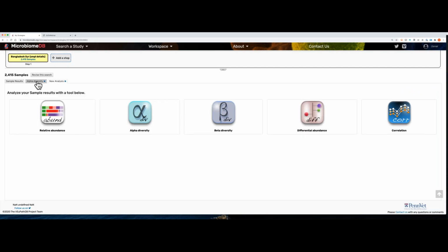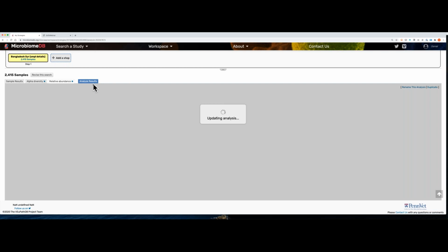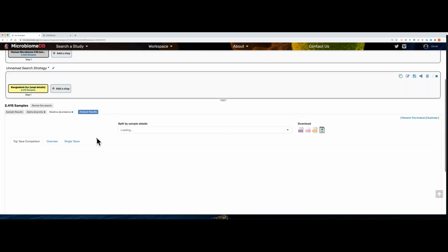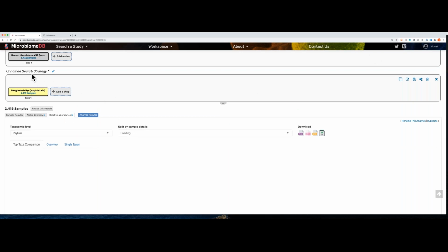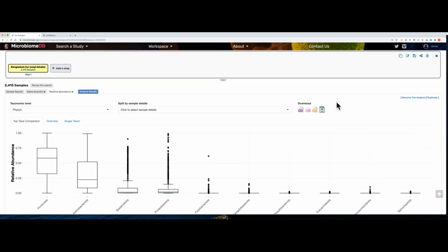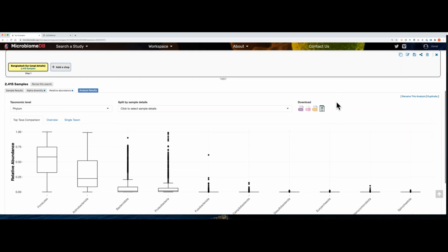Okay. So that's really cool, and we could also open up additional apps, each app staying open as its own tab. And so you could imagine having a sort of gallery of apps open that you could toggle through these visualizations. And if you're logged in, all of these searches could be named to give them a unique name. Once they're named, they can be saved and they can be shared. Okay, and sharing them actually just generates a link that you could send to your colleague and they would be able to see. So this makes it easy to have really transparent and reproducible searches on the website.